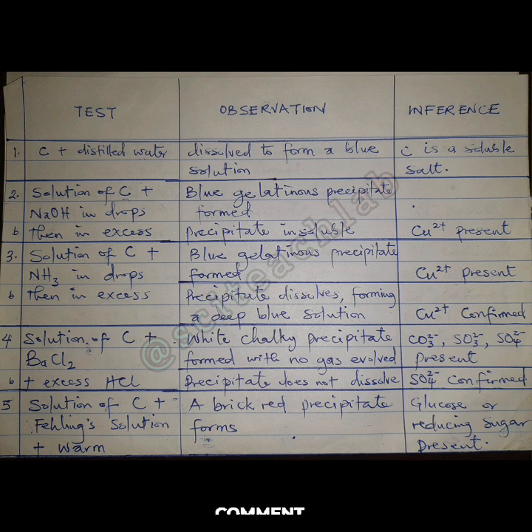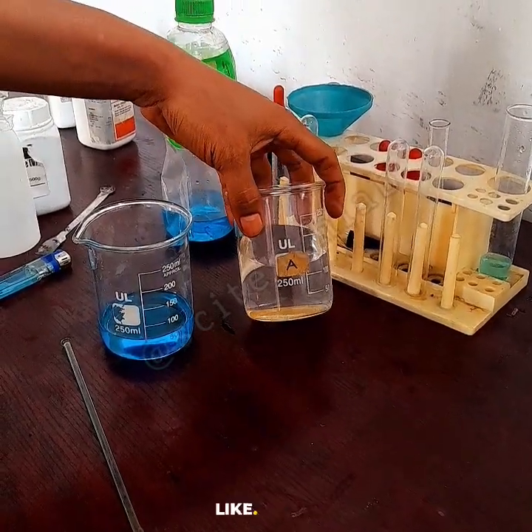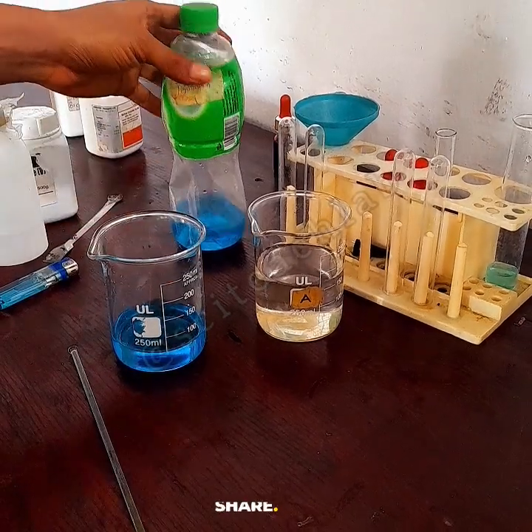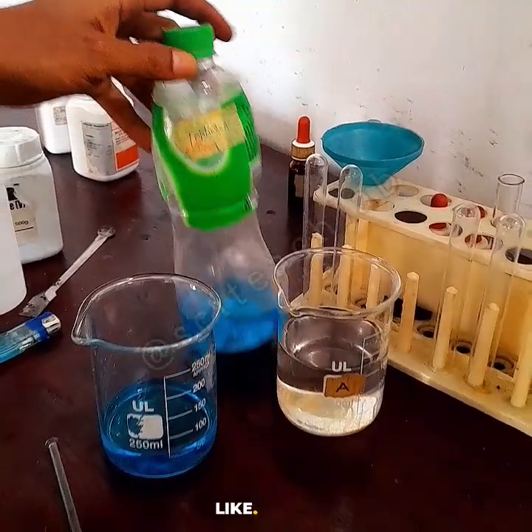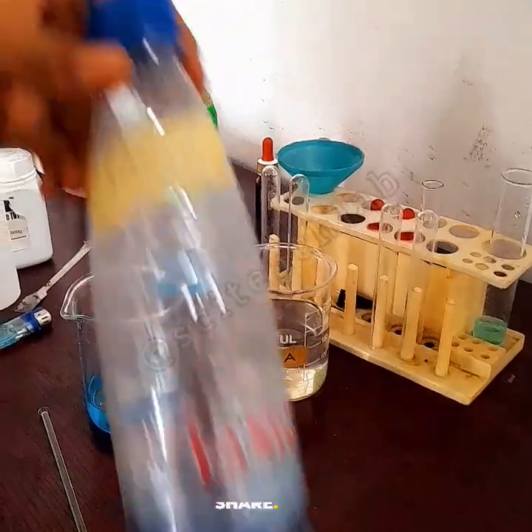Now, what is the other salt? We get back to the lab to test for the other salt or the other substance. So in this practical, we need 2 reagents. We have Fehling's A and Fehling's B. Fehling's A is the blue one you are seeing. Okay, that's Fehling's A, and then Fehling's B is the transparent one. Ignore the A in the beaker.